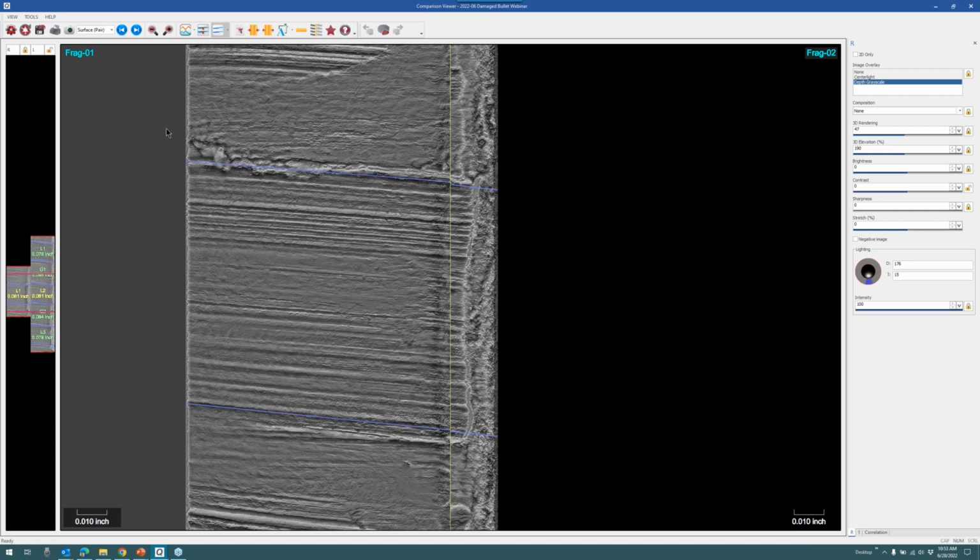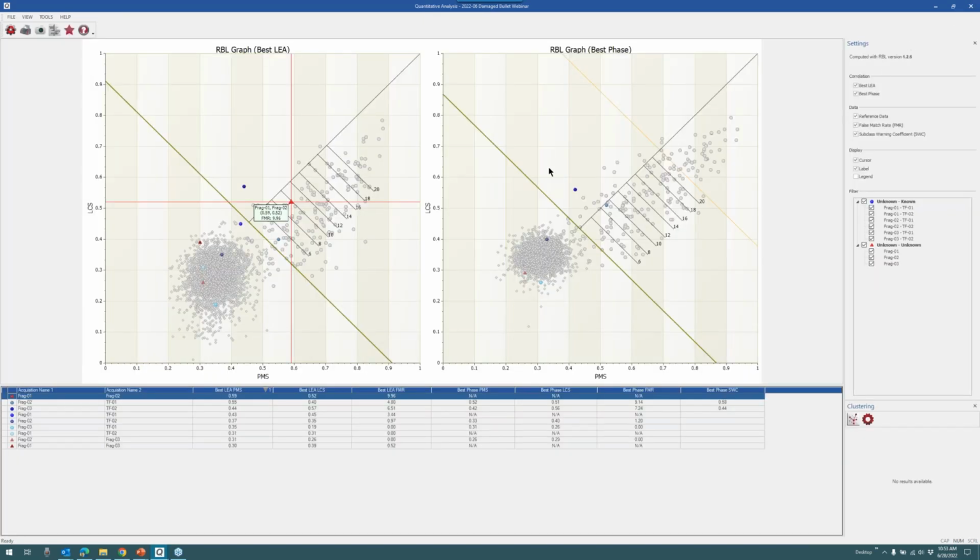I could look at them in the shape view rather, but let's just get out of this for a second now. And let me close my email too, because that's doing no favors. And so that was, let's order it by the FMR value.